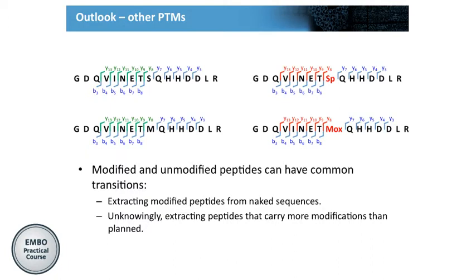So whenever I've shown you before that there are 2 phosphoforms, in theory one could consider that in a certain sequence this could also be one phosphoform and the other is the oxidized version of this same peptide, etc., etc. So there are more combinations and things to consider depending on the specific sequence and all the information that we've collected about retention time, relative intensities, and so on.